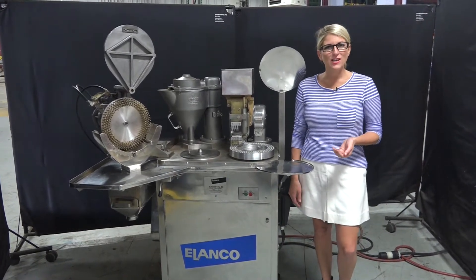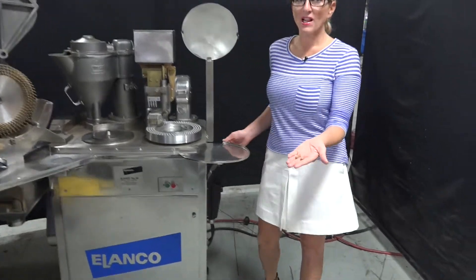The voltage is currently set to 3 phase 240 volts. Today we'll be filling these double-aught capsules.